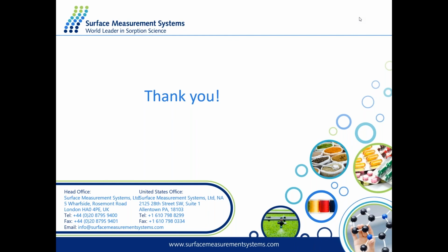Great, thank you. A question from Alan Connolly, and he asks, can IGC be used to predict the suitability of coating materials? Yes, definitely. In this case, we will do a study based on work of cohesion and adhesion. We can understand how likely the material is to interact with itself compared to how likely the material is to interact with the coating material.